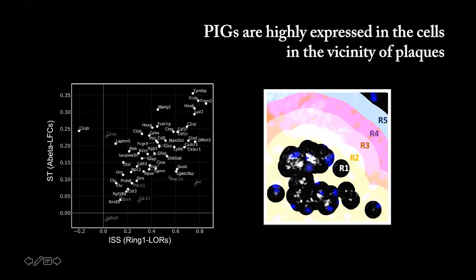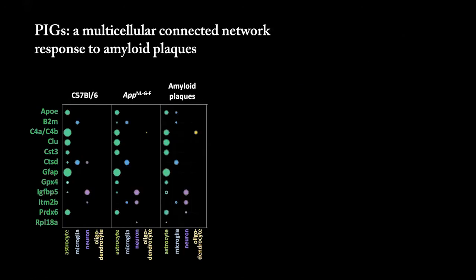So this is the level change of gene expression detected by spatial transcriptomics on the y-axis, and the x-axis indicates the log odds ratio of the gene's presence around the amyloid plaque. Both technologies show that these genes are highly enriched around the plaque, especially TREM2 and TYROBP, which have the highest enrichment. Furthermore, in situ sequencing tells us which cell type expresses those genes in different conditions.